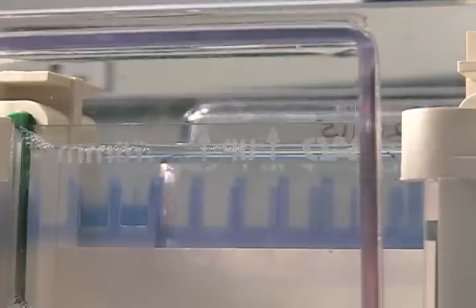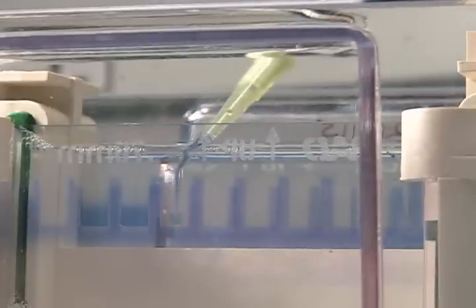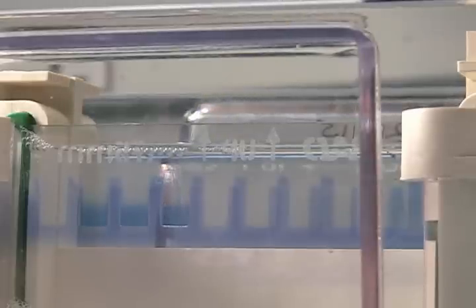You should save one of the wells for a molecular weight ladder. And once you've filled as many wells as you plan on using, it's ready to run.